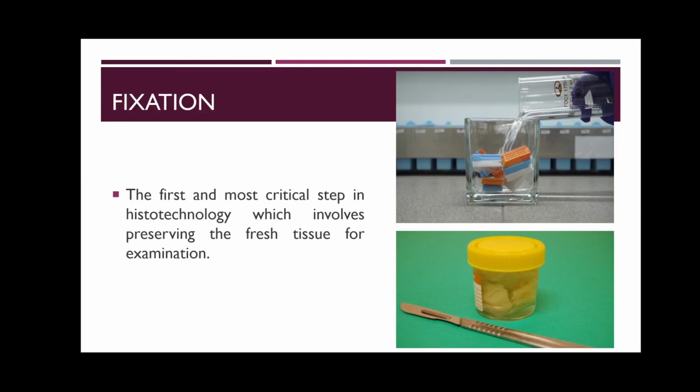So the most common fixative that is used in our hospital is the NBF, the neutral buffered formaldehyde or formalin. So again, what is the purpose of fixation? This is to preserve the specimen in as lifelike as possible.